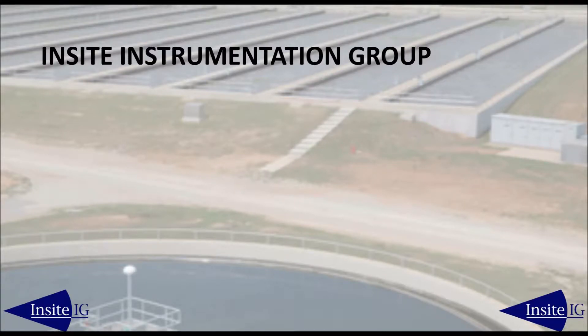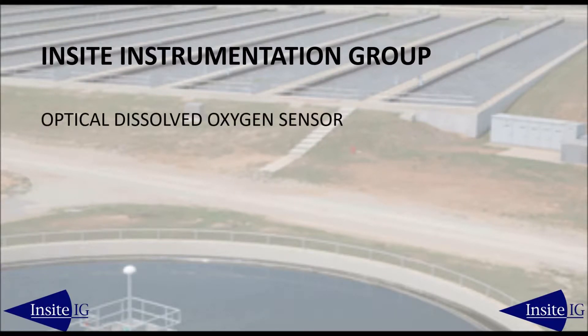Welcome to a short presentation of the Insite IG Optical Dissolved Oxygen Sensor.